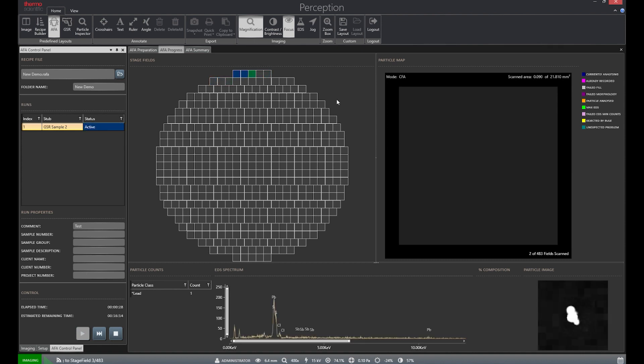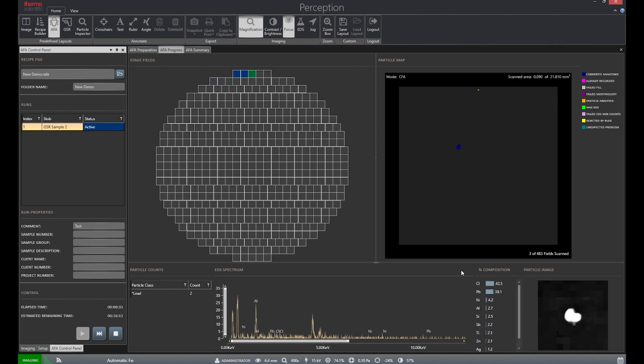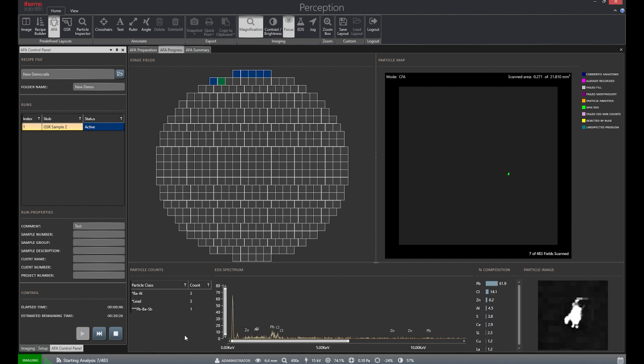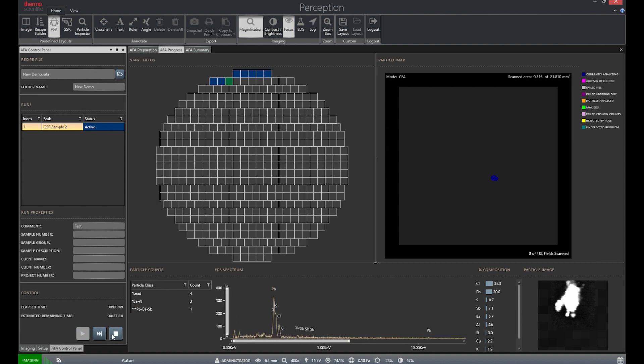When a particle is found, the system will show the image of said particle on the bottom, and then immediately collect an EDS spectra. We can stop the run now and show the data the software has collected.